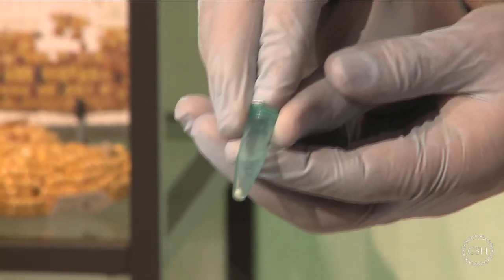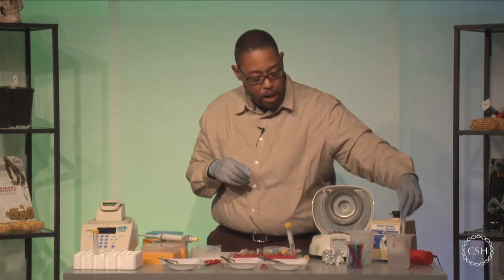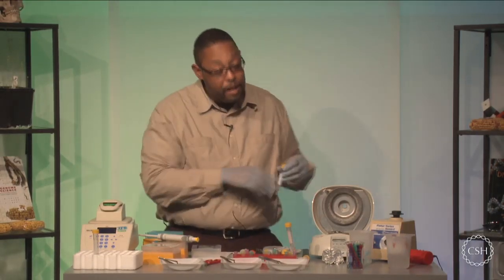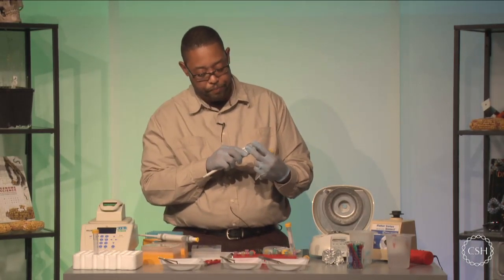Okay. Now, to each of these pellets, I'm going to add some wash buffer. So I'm going to go to my ice cold wash buffer over here to my left, and I'm going to add 500 microliters of this solution to each of my test tubes.